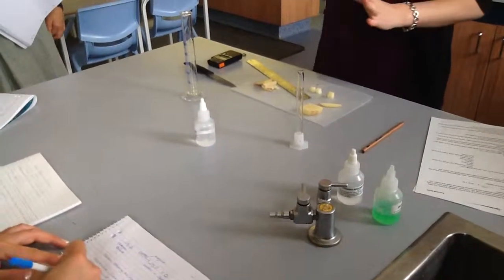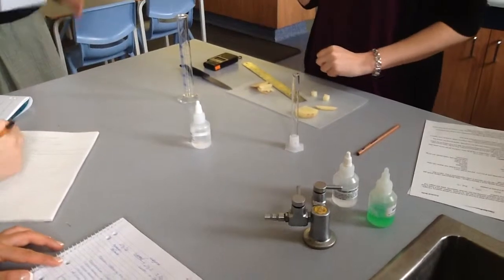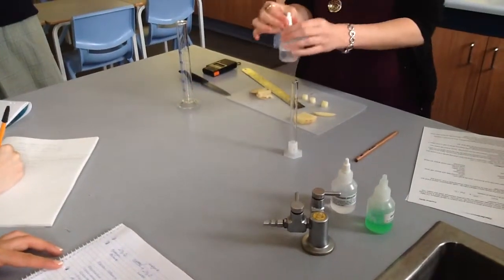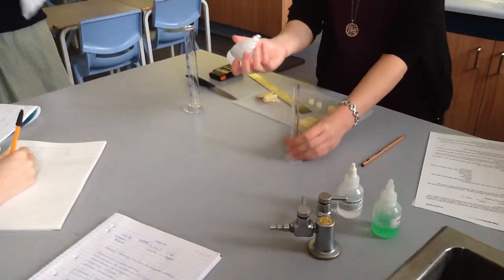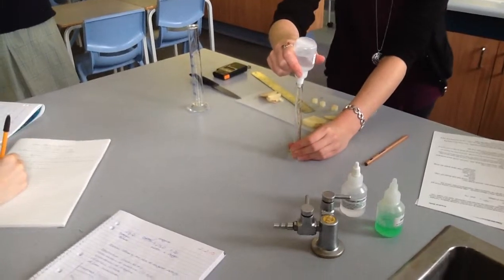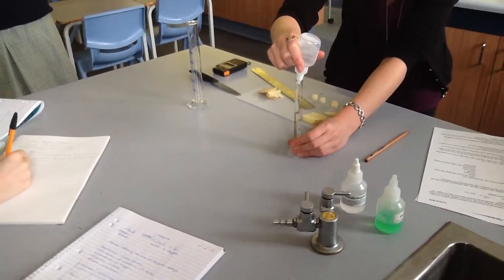So the foam method is fairly simple and straightforward. You need a source of your catalase, so you need a cube of whatever you're using: potato, capsicum or liver. The volume can vary, but I'm going to start with 10 mils of my hydrogen peroxide. I've actually got it at quite a high concentration, 6%, just so that the reaction will be quite clear.